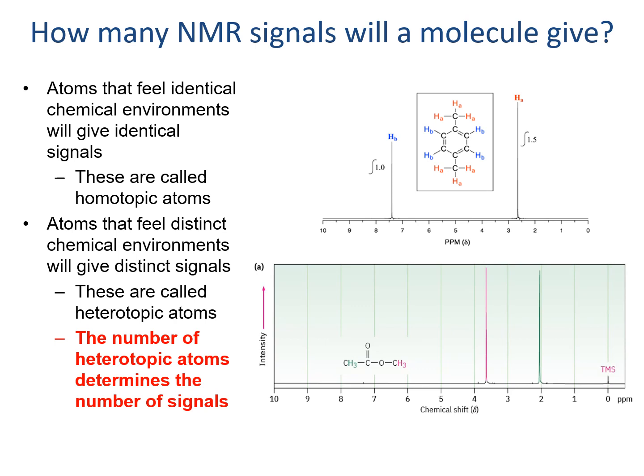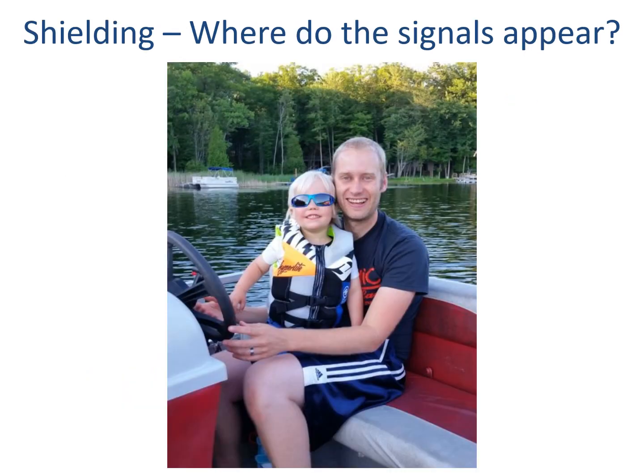So similarly to the example above, the example that's shown down below has a CH3 that's attached to an oxygen that's shown in red, and the peak is shown in red as well. That's a different signal than the carbon that's attached to a carbon double bond to oxygen. That carbon is going to shift less, and so we see that signal show up as indicated in green in the spectrum.